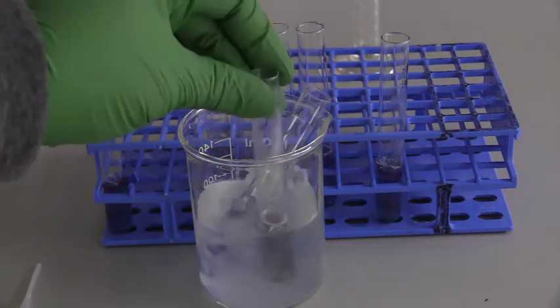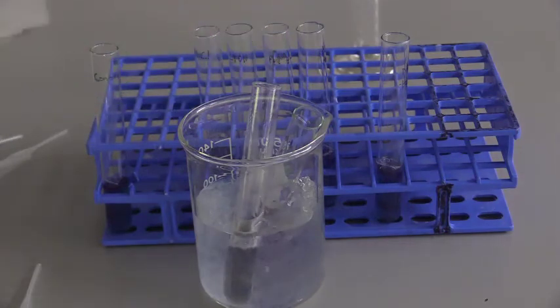Okay, so the hot sample, if we cool it down, will the activity return? And with the sample when the acid was added, what happened? And was it reversible when we added the sodium hydroxide? And with this tube with sodium hydroxide, when we added the HCl back in, did that return the activity? Was that reversible?